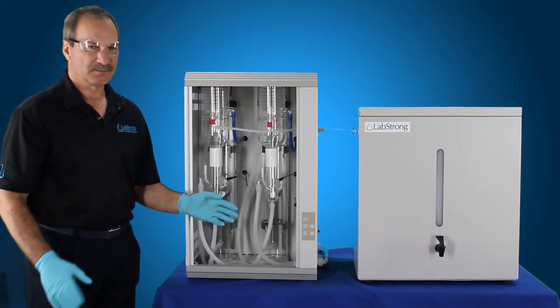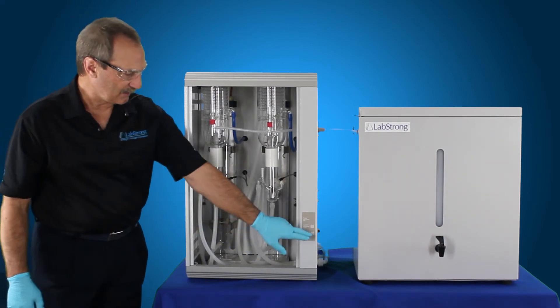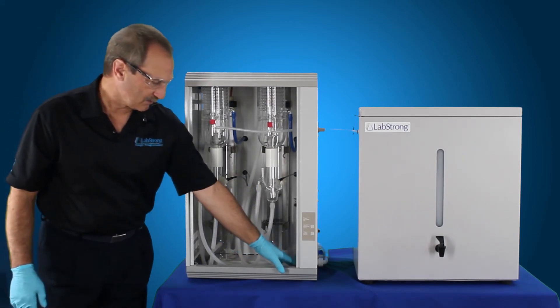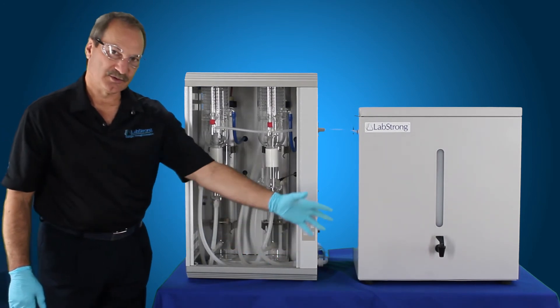So you're going to let the system sit for about 30 minutes. You don't want to really go too far — 30 minutes, maybe 40 minutes. Then you want to go ahead and hit the clean button once.